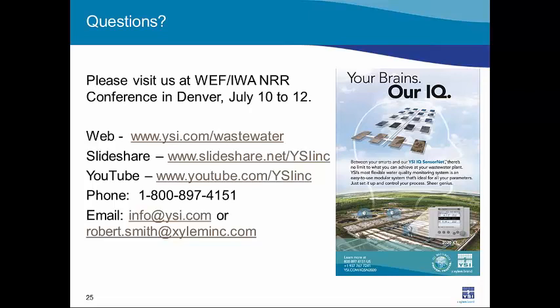Yeah, that's an important thing to decide, isn't it? As I mentioned, it's real easy if you have to measure very high concentrations of nitrate because you get a higher measuring range up to 1,000. But even more so, I think even if you're monitoring on the higher end of those nitrate concentrations, you might choose to go with an ISE simply because it's less expensive.